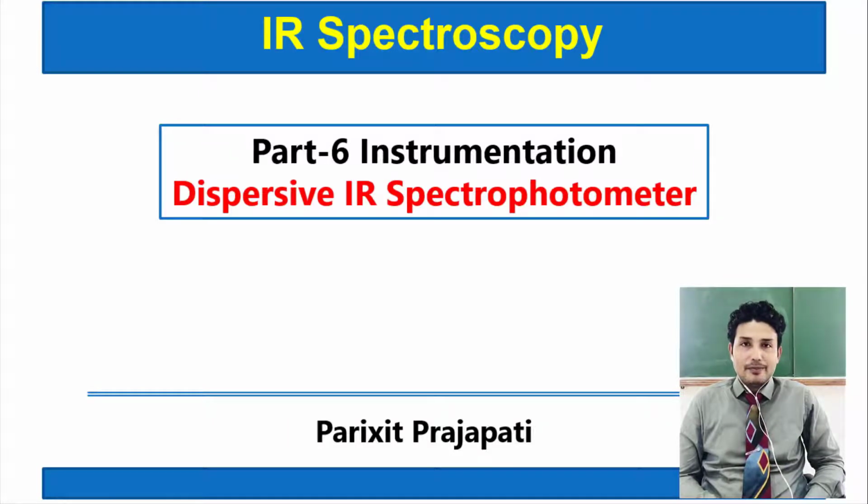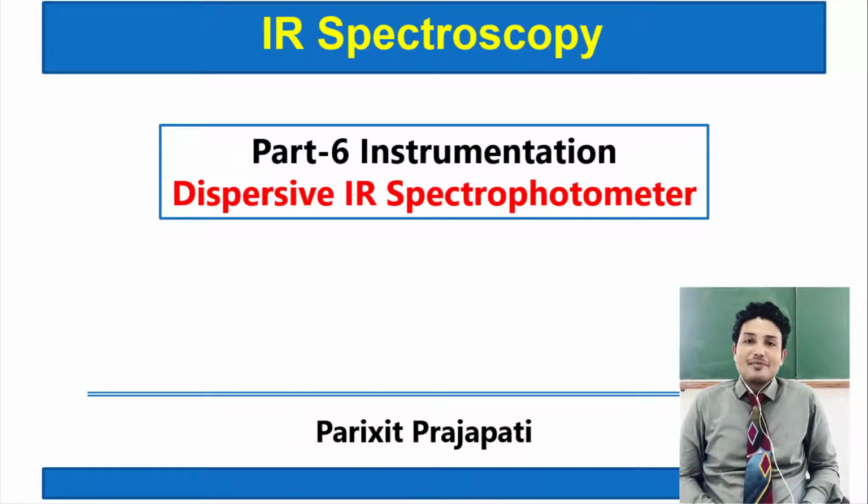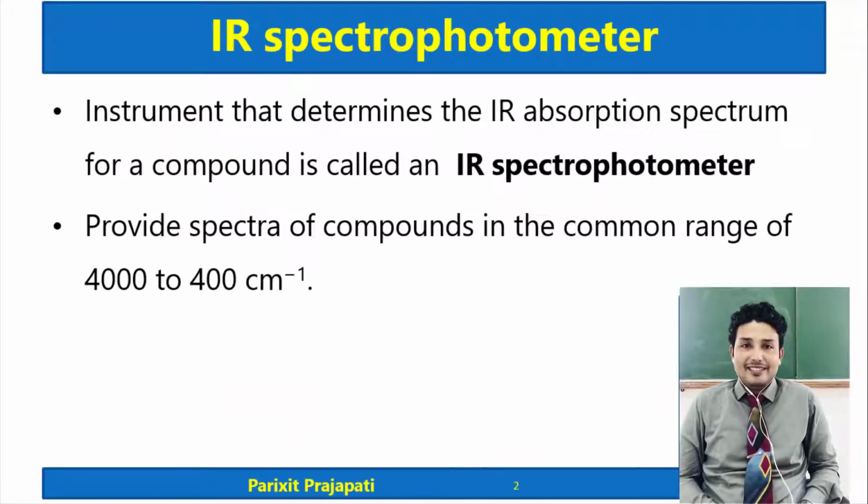In this session, we will discuss a very interesting topic, that is instrumentation of dispersive IR spectrophotometer. So let us begin with the session.